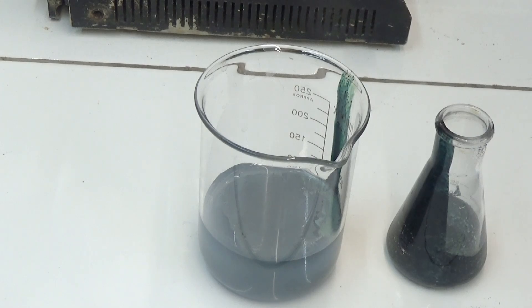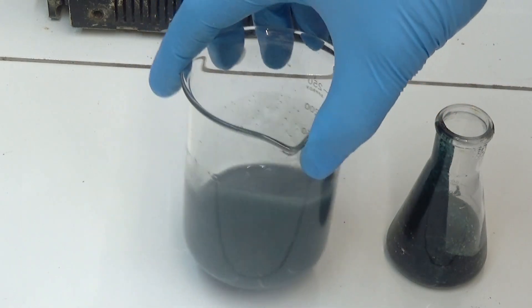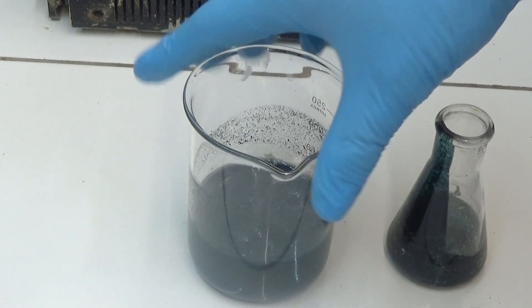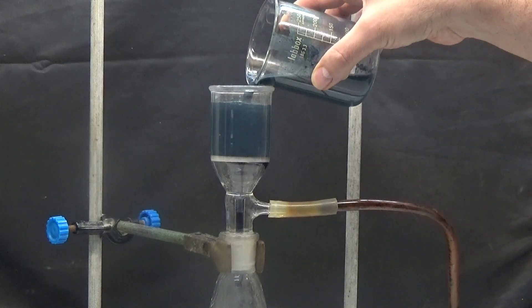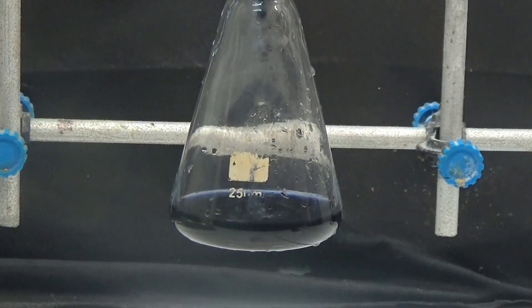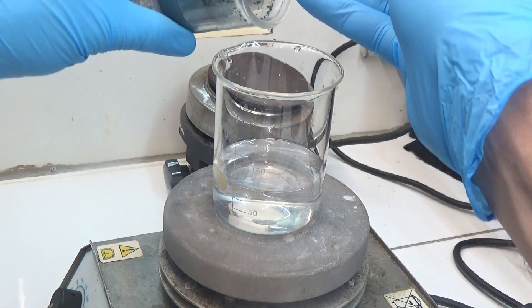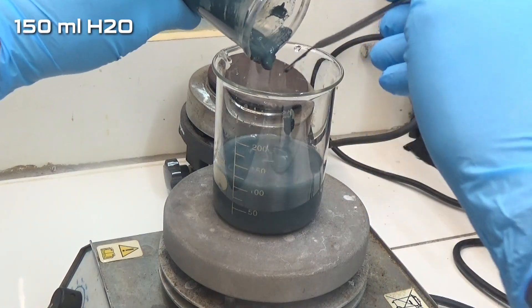Immediately a precipitate is formed. Collect the precipitate by suction and wash with little water. The collected solid cake is dispersed in about 150 milliliters of water and boiled for 40 minutes.